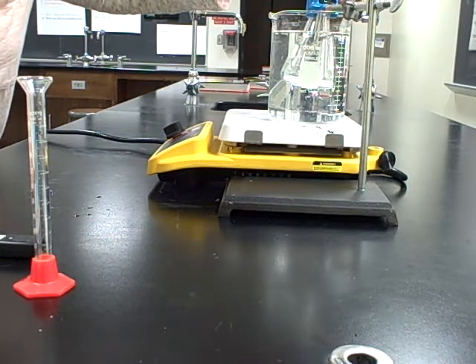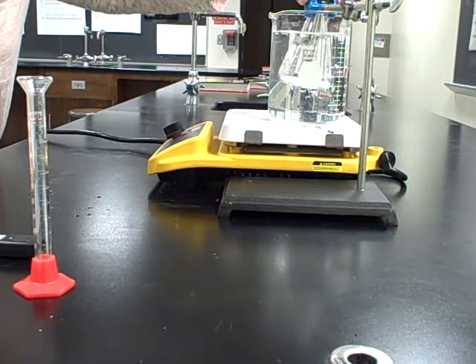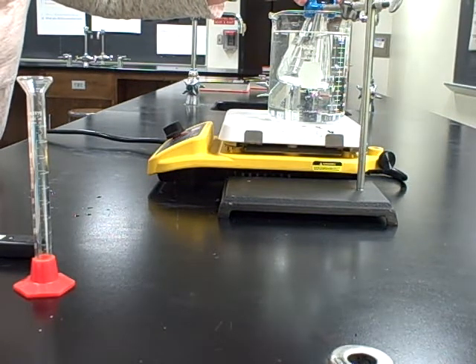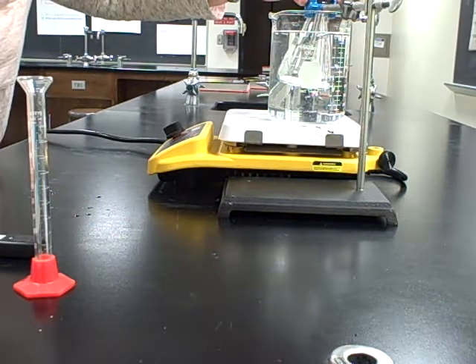You're going to go ahead and heat it. It says the flask should be at least 0.5 centimeters from the bottom. That won't be a problem with the height of these beakers. Heat until all liquid evaporates and excess vapor is no longer expelled.